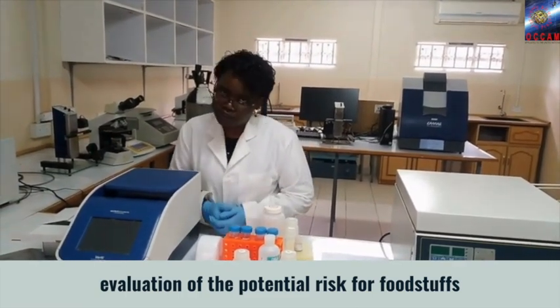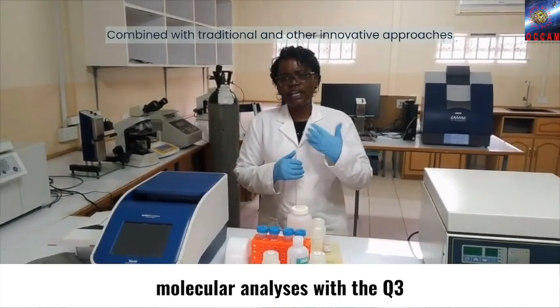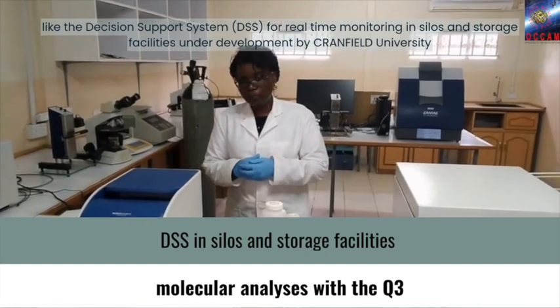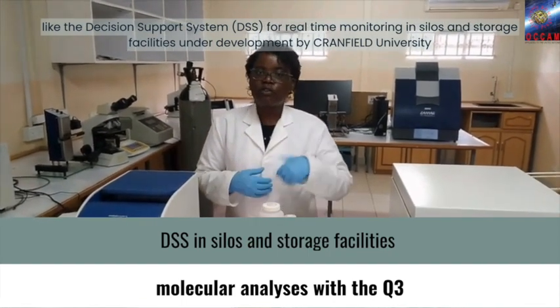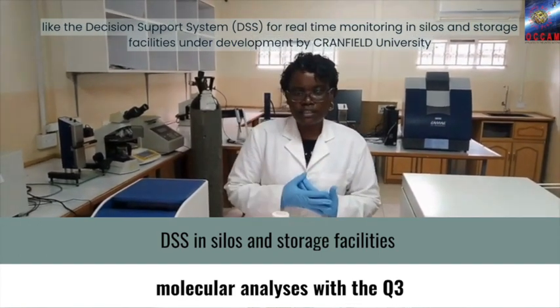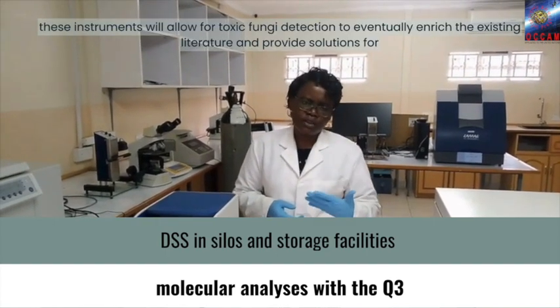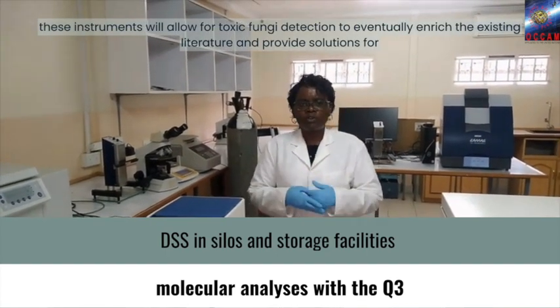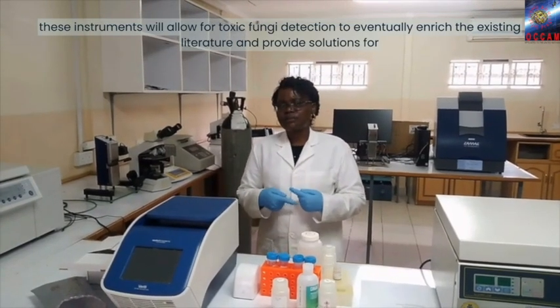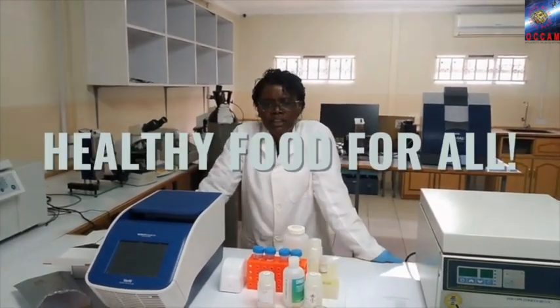potential risk for foodstuffs. Combined with traditional and other innovative approaches like the decision support system, also known as the DSS, for real-time monitoring in silos and storage facilities under development by Cranfield University, these instruments will allow for toxic fungi detection to eventually enrich the existing literature and provide solutions for healthy food for all.